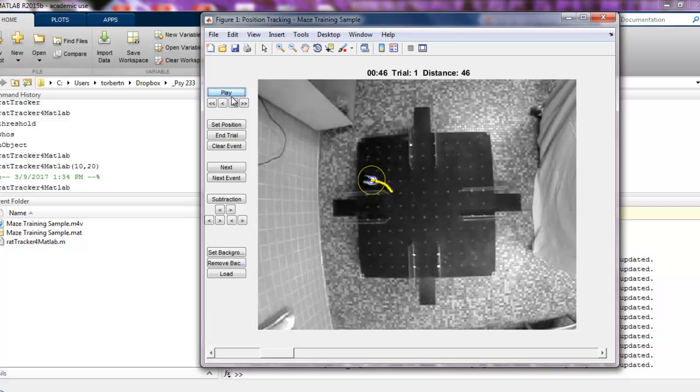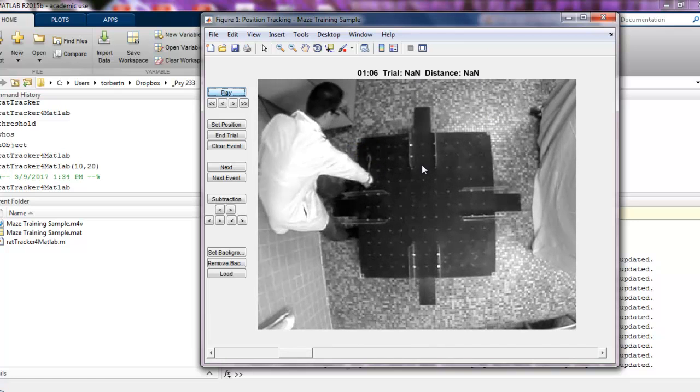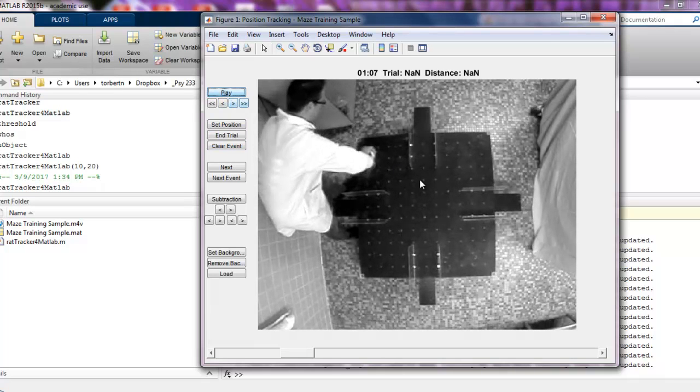In this case, we're waiting for the rat to select one of these reward cups. For our analysis purposes, we'll mainly look at the time it took the rat to approach that location and retrieve his reward. It was about 104. I came in, and you'll notice up here, at that point we marked it. We hit the -1, and now the trial has ended. Now we're just playing forward. So at that point, we've now processed all of trial 1.